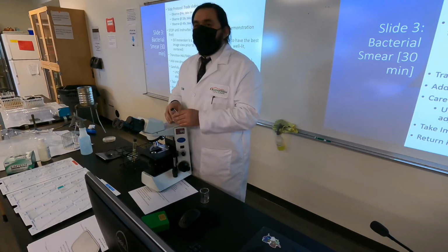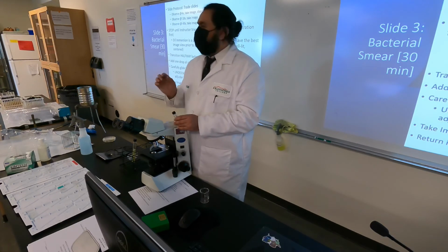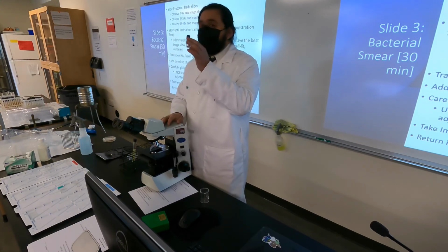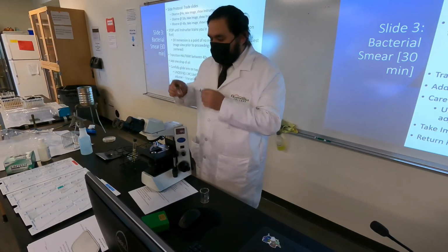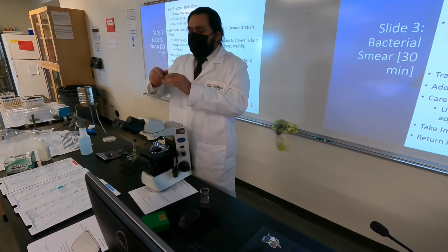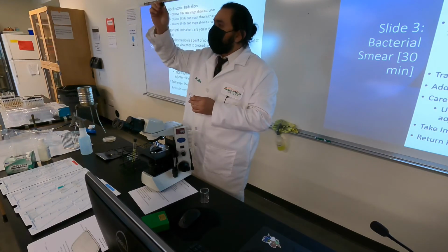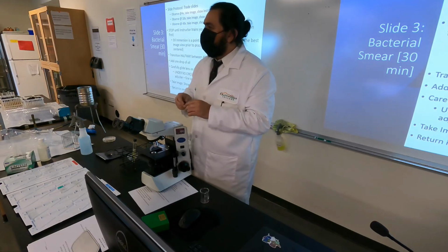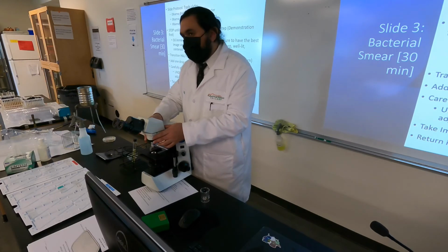The more drops of oil, the blurrier it gets, and 2, the more you have to clean. You just need 1 drop. You just need it to lubricate, and it adds to refraction. That cool thing we learned in lecture about bending light, the oil helps you do that too. So what you're gonna do is do the inverted V, take your little rod dropper, and just 1 little tap, bam, of 1 little drop of oil onto your slide, and then you'll allow this guy to kind of glide in.